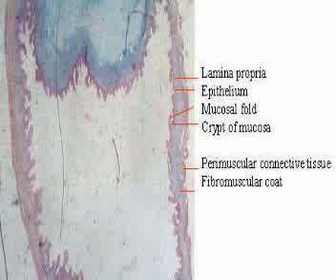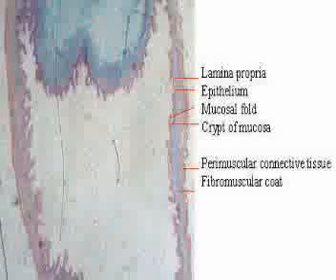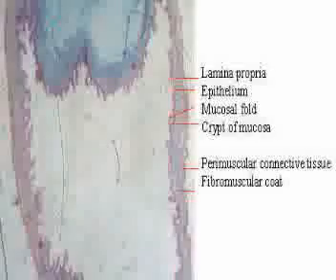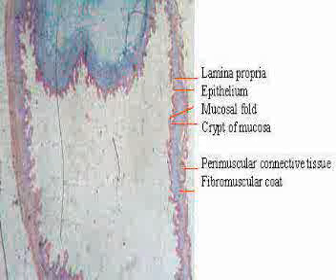Gallbladder has no muscularis mucosae, and hence its mucosa consists of only lamina propria and epithelium. Its submucosa merges with the lamina propria and its external coat is fibromuscular. Its epithelium is simple columnar. It has mucosal folds like fallopian tube but not villi.